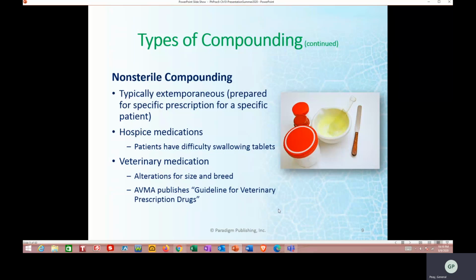So for non-sterile compounding, I will send a few YouTube videos that show this technique. It's very easy. If you look at this slide on page 9, these are some of the common apparatus that you have. All the way to the right, what looks like a knife a little bit, is your spatula. Remember, you use this for compounding as well, because sometimes you have to mix ointments or blend them together. And it's the same device that you use for counting pills.